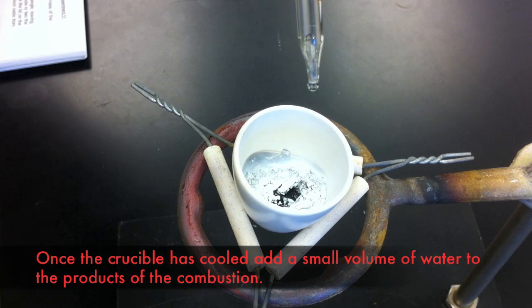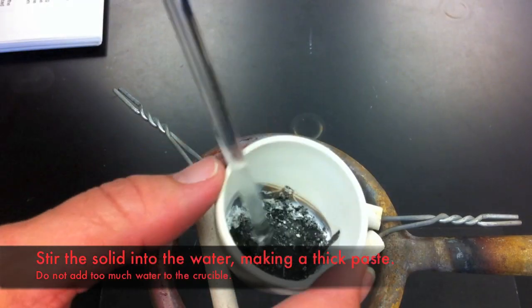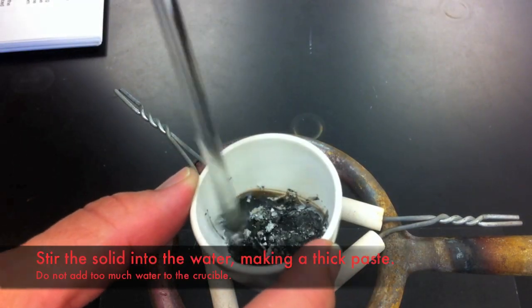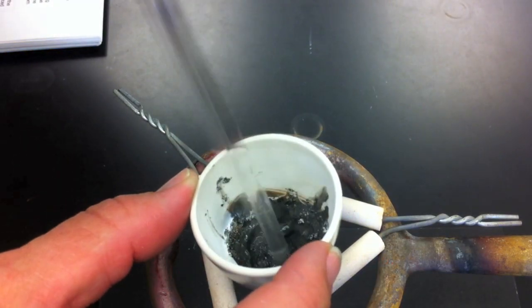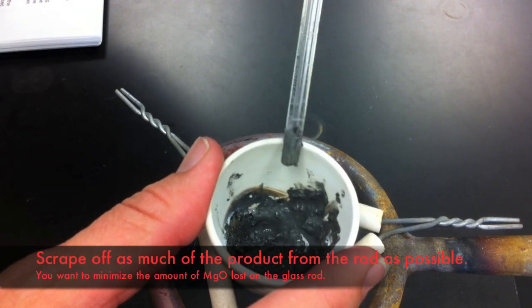Using a medicine dropper, add a small volume of water to turn the solid in the bottom of the crucible into a thick paste. You'll do this by stirring it up with a glass stirring rod. Ensure that all the material remains within the crucible, so wipe off the stirring rod on the edge of the crucible before you complete this step.